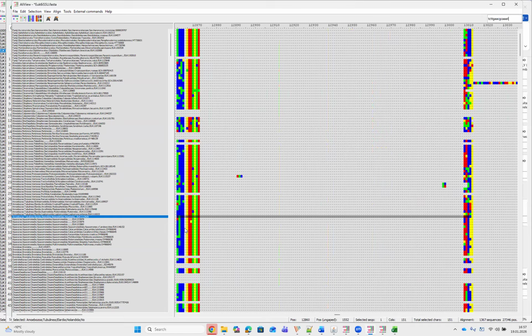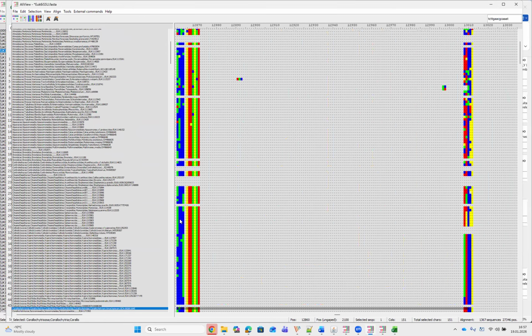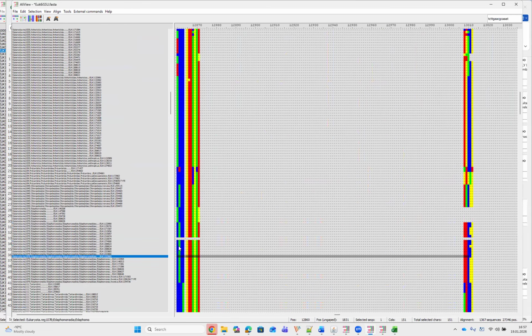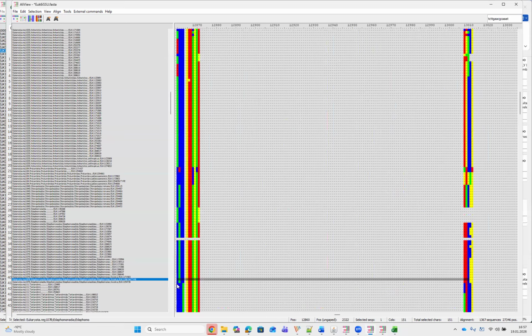What we see is that this sequence is present actually in Amebozoa, also Pusozoa, and of course in all our target. So unfortunately, this one is not suitable as a distinguishing mini barcode for this family. We have to find another one.